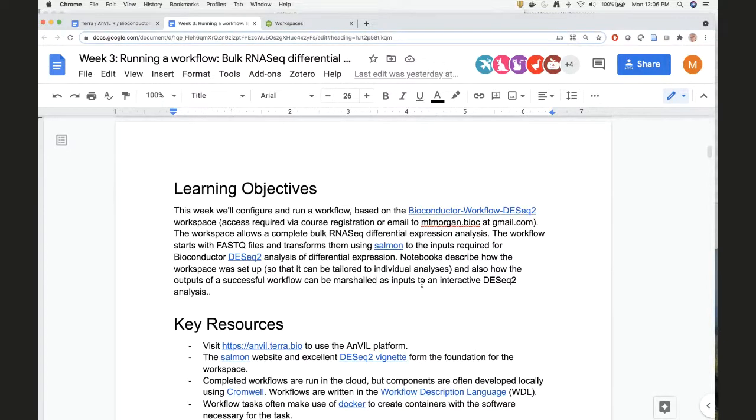The idea is you've sequenced a bunch of samples, RNA-seq sequencing of a bunch of samples, and you have FASTQ files. The FASTQ files need to be aligned to a reference transcriptome, and there are these so-called ultra-fast aligners, Salmon and Kallisto and so on, where ultra-fast means that they take, say, 10 or 15 minutes per FASTQ file to do the alignments.